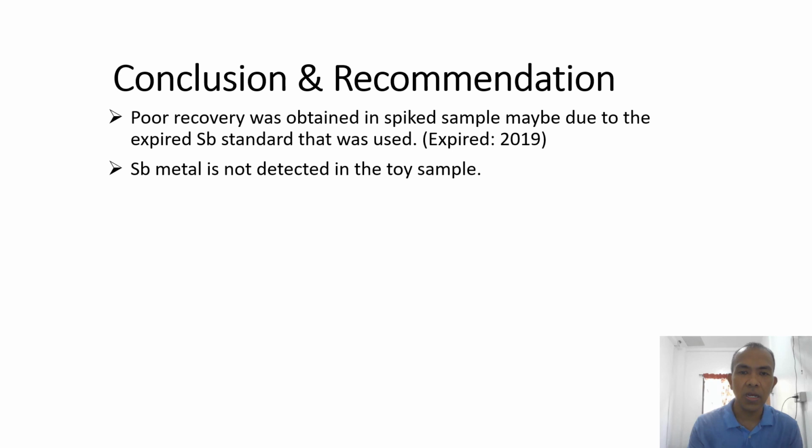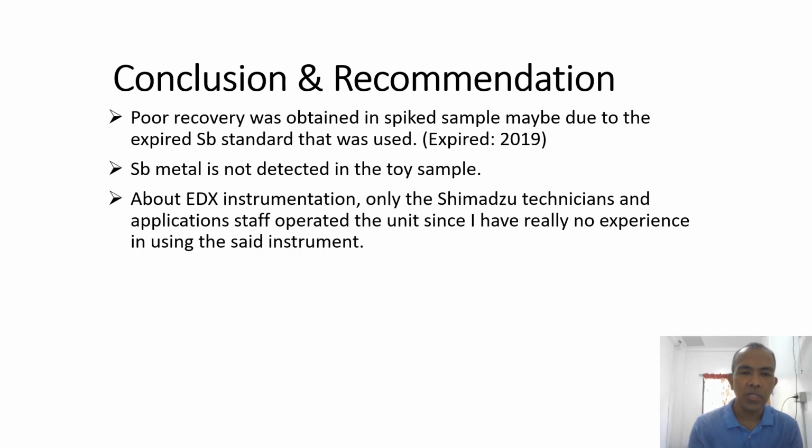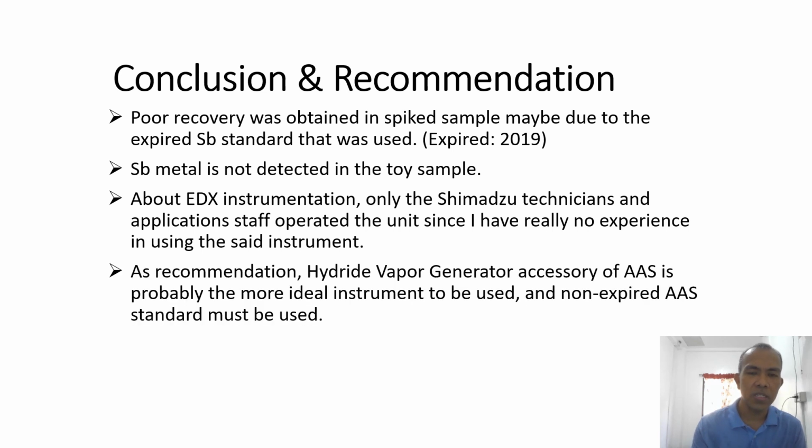So, good thing, antimony is not detected in toy sample. But EDX instrumentation, as I said, all the Shimadzu technicians and application staff operate the unit, since I really have no experience in using the said instrument.